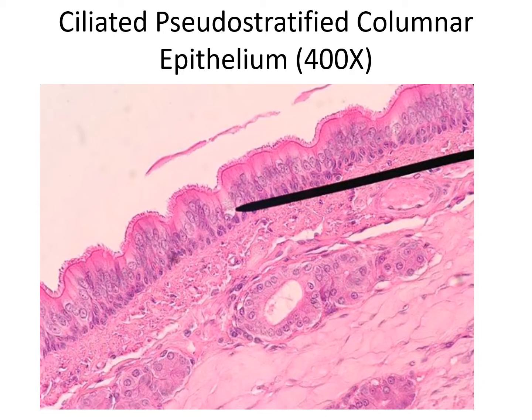Next one is ciliated pseudostratified columnar epithelium. So again, when we look for epithelial tissue, we are either looking close to the free surface, so here's our free surface, or maybe some ducts. So here I have some duct, and maybe this is some kind of tube. But this is definitely not our pseudostratified. This is simple cuboidal here.